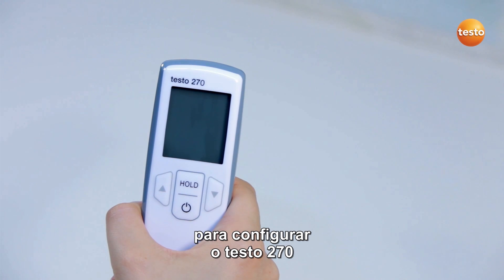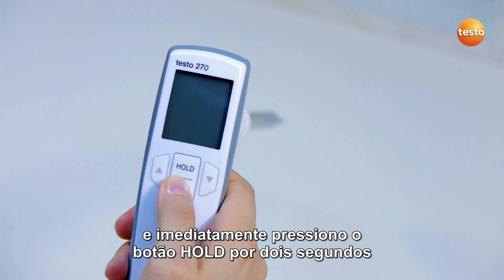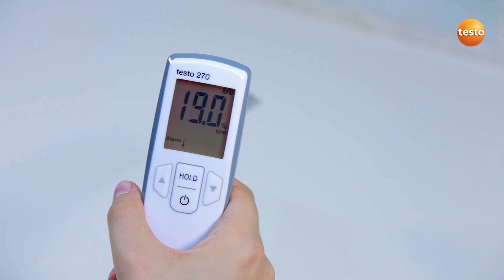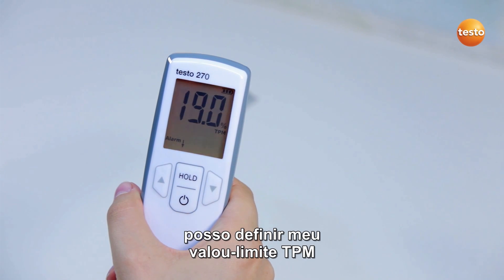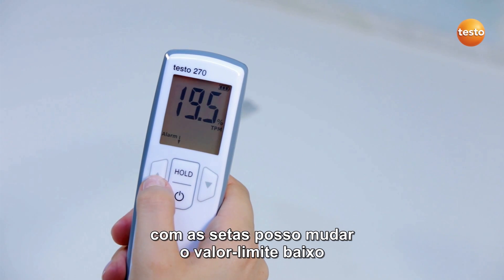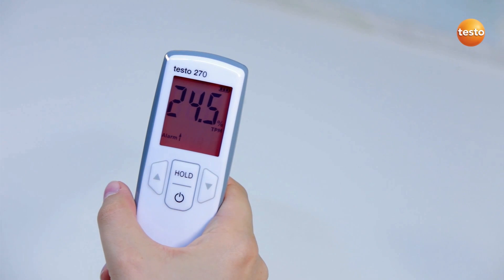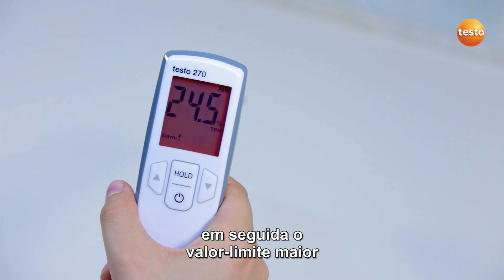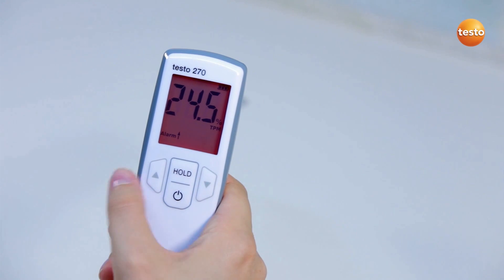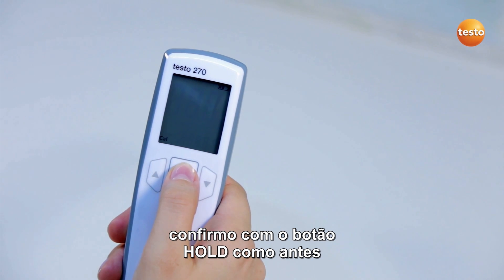In order to configure the Testo 270, I switch it on and immediately press the hold button for 2 seconds in order to access the configuration menu. In the first menu item, I can define my TPM limit values. With the arrow buttons, I change the lower limit value and confirm with the hold button. Then comes the upper limit value, which I also set using the arrow buttons. To save the adjustments, I confirm with the hold button as before.